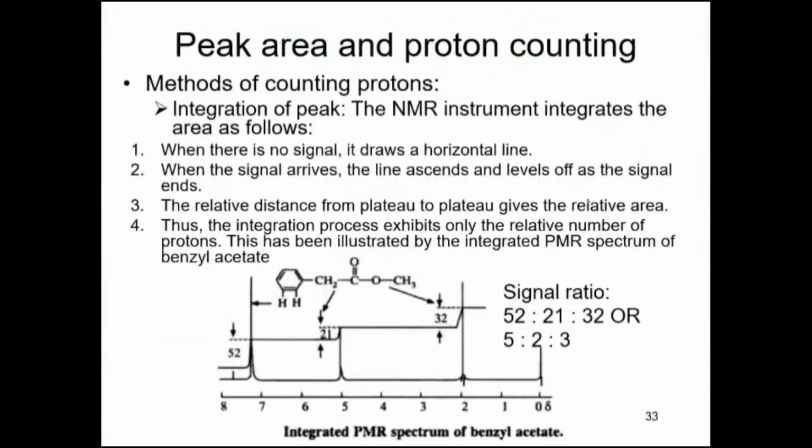Now there is another method of counting. It is called the integration method. Now I will read it out, then you will understand it better. I will explain it. The method is called integration of the peak. This is the modern method. Modern instruments use this method.